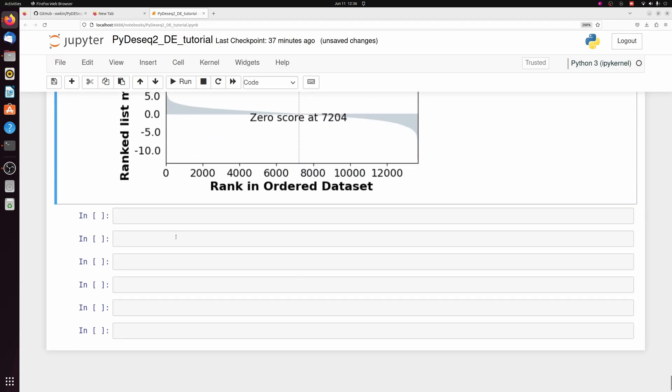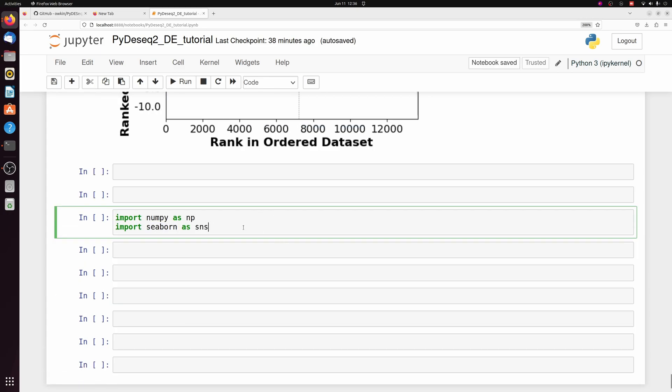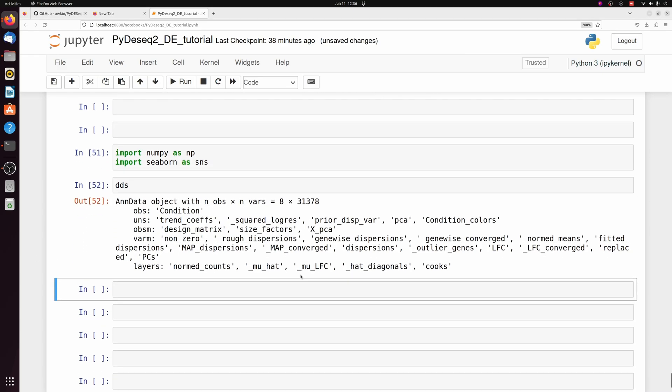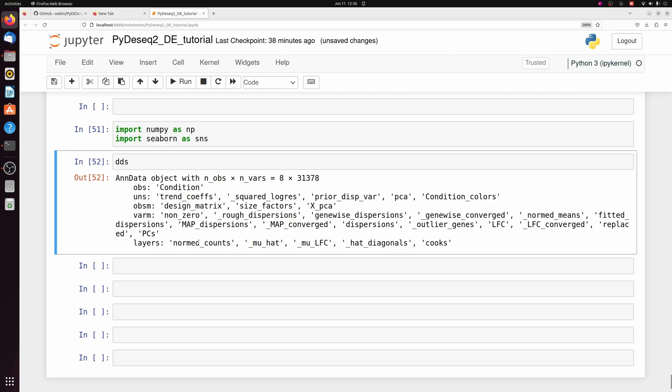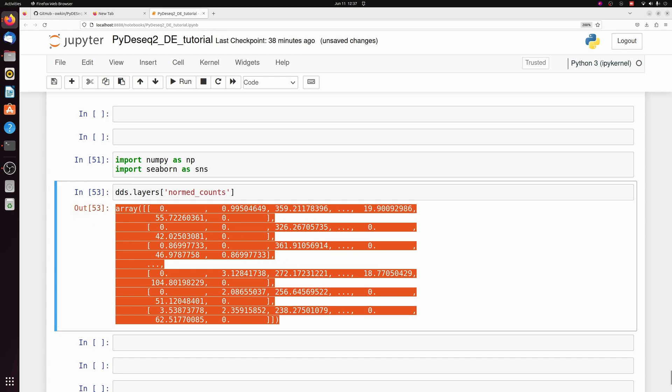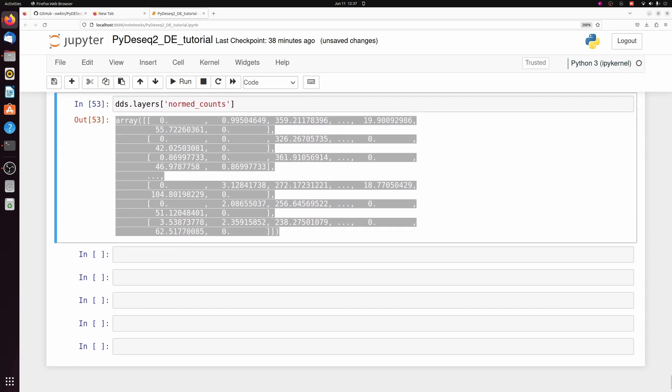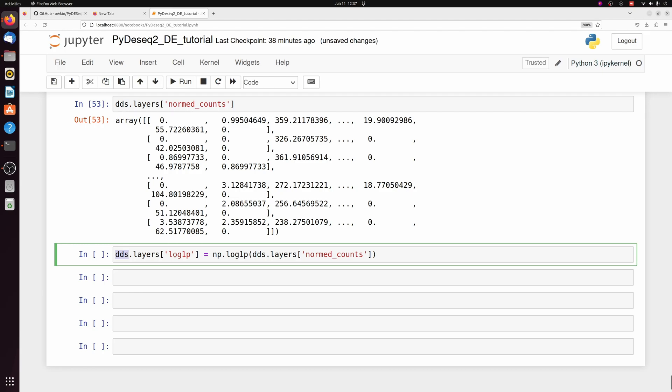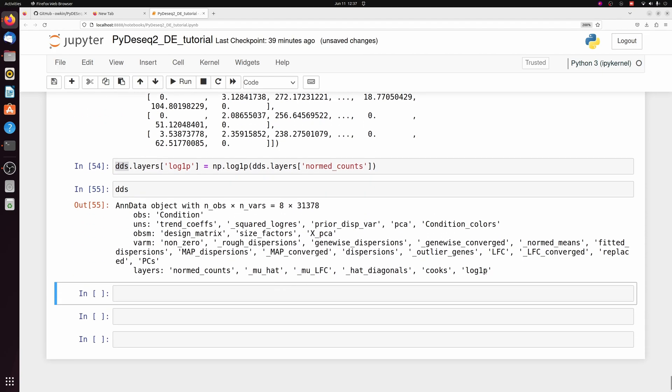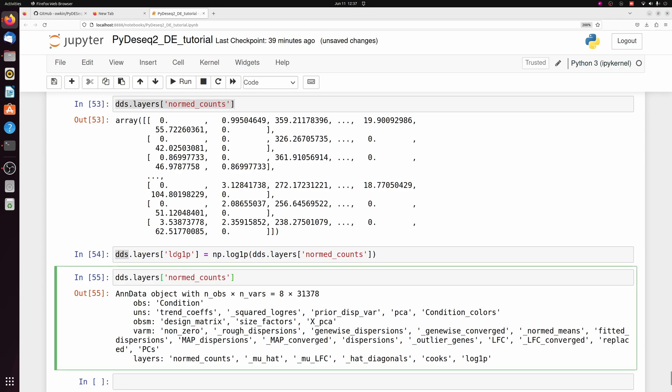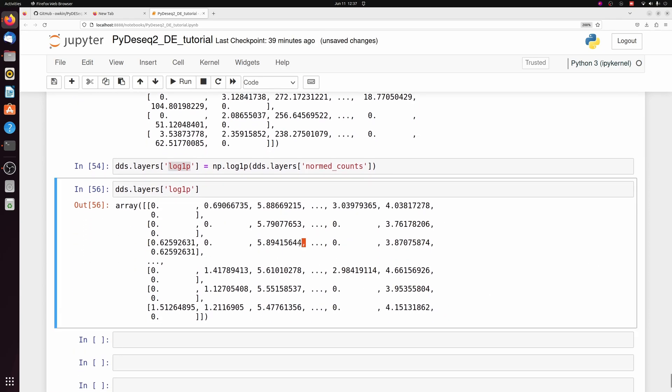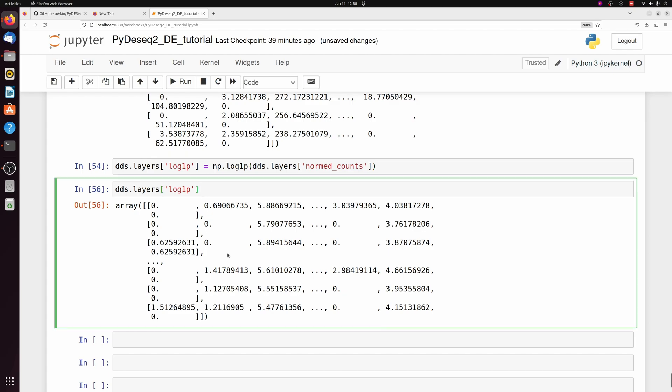Let's make a quick little heat map. So we're going to import NumPy and Seaborn, which is just a plotting module. So again, we're going to go back to our DDS object. And we can actually get the normalized counts from our layers here under NormedCounts. So if we do DDS.layers NormedCounts, we get the actual normalized values. I'm going to create one more layer using these NormedCounts within our DDS object. And it's going to be the log1p values from our NormedCounts layer. And if we look at DDS, of course, we just added another layer, log1p. And if we look at that, it's just a matrix of log normalized values. So this is what we're going to use to plot the heat maps.